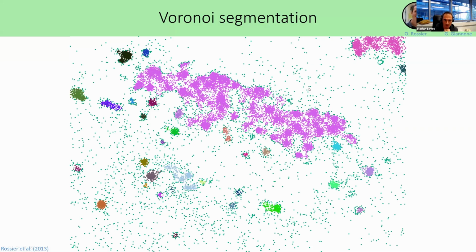So for the adhesion site, you can compute the average density of the adhesion site, apply 1 times the average density of this adhesion site in order to have a second level of segmentation and manage to do the clustering inside your adhesion site. And you can have that very robustly because of the Voronoi normalization, fix your different threshold and apply it to all of your sample on the same condition.